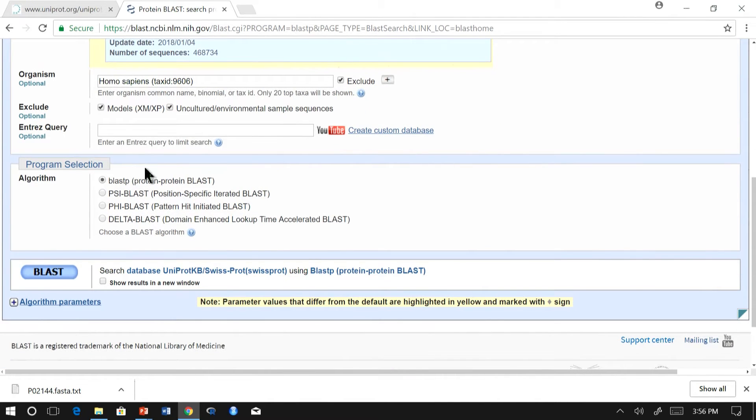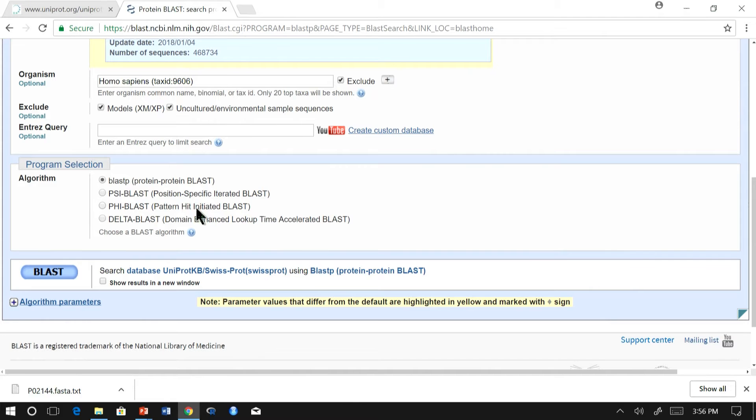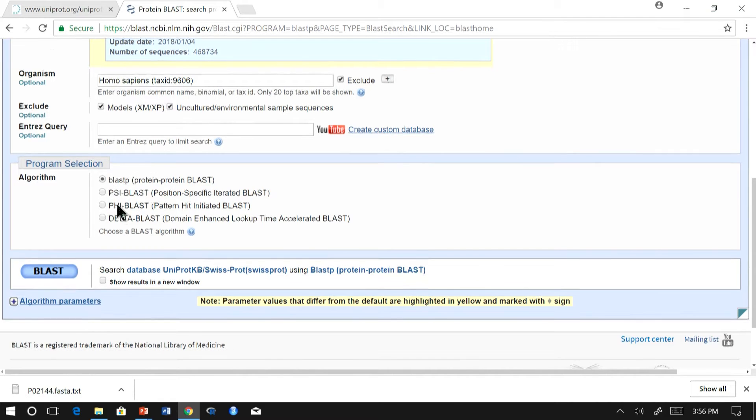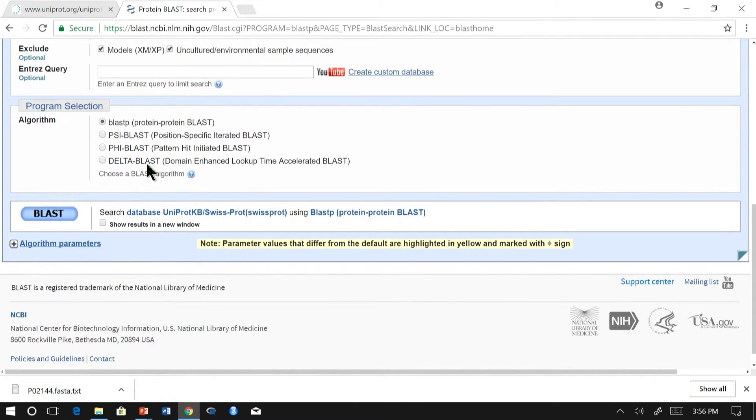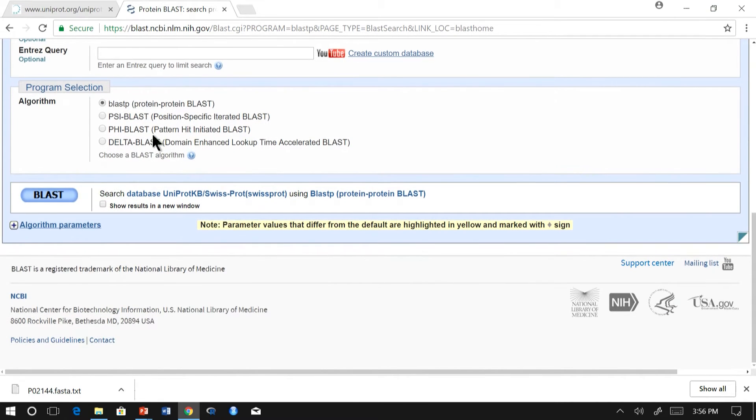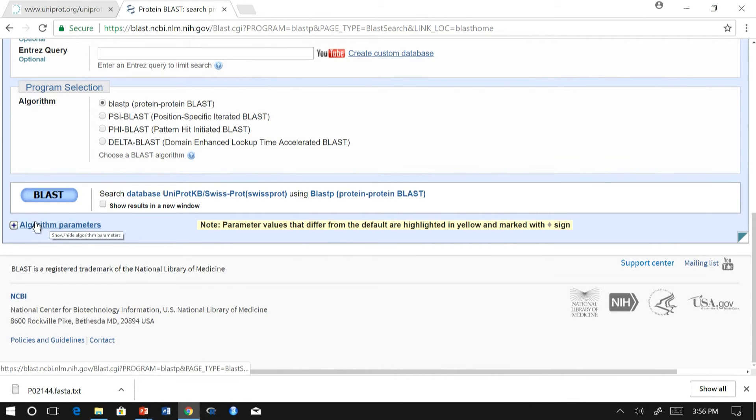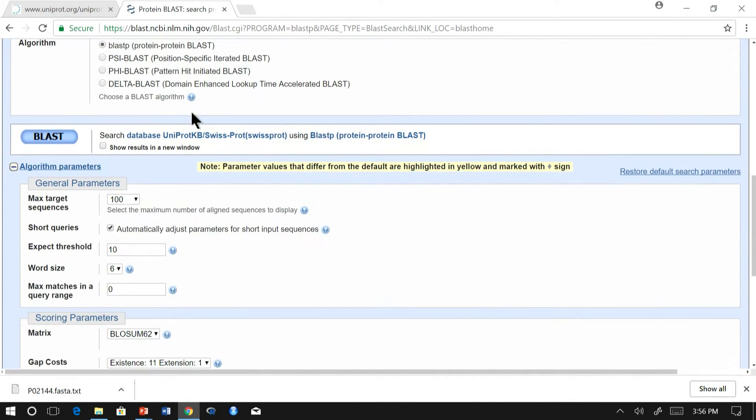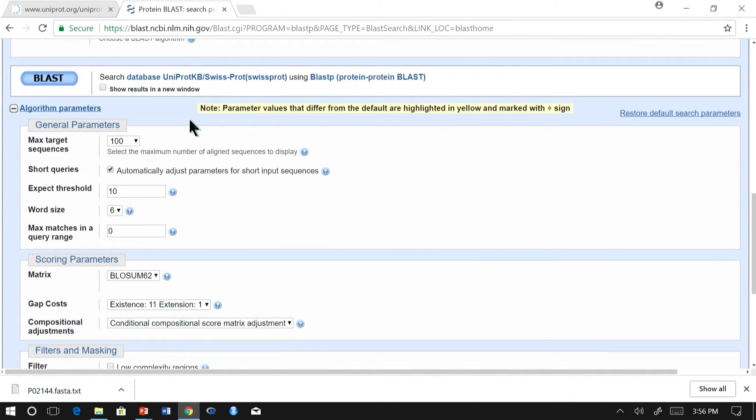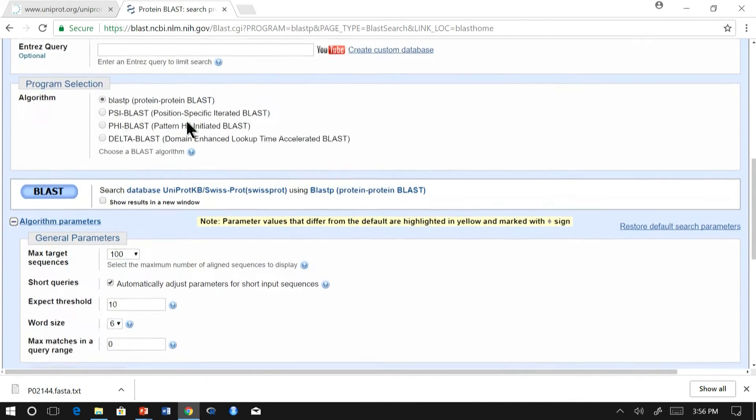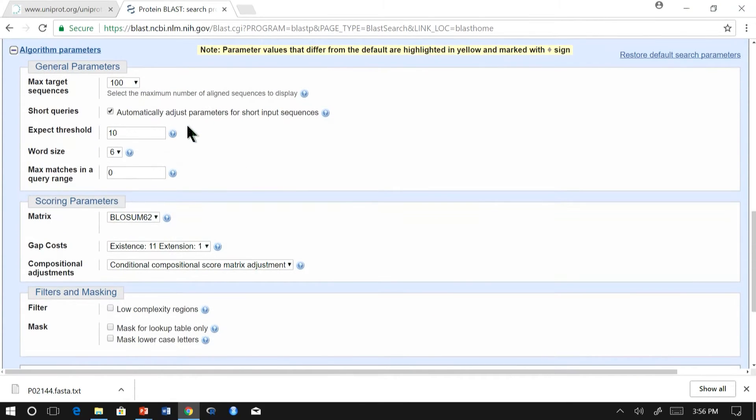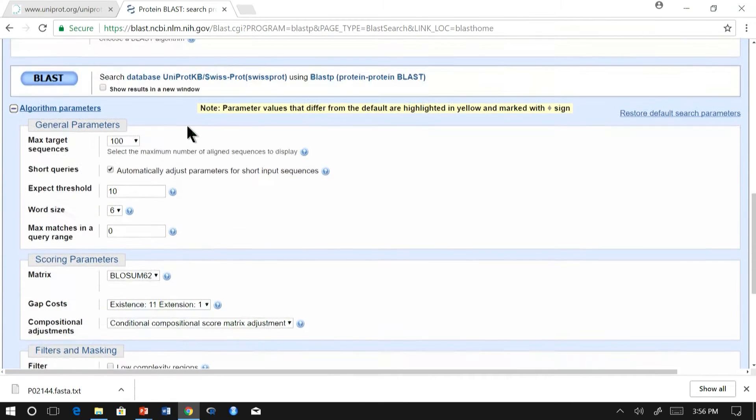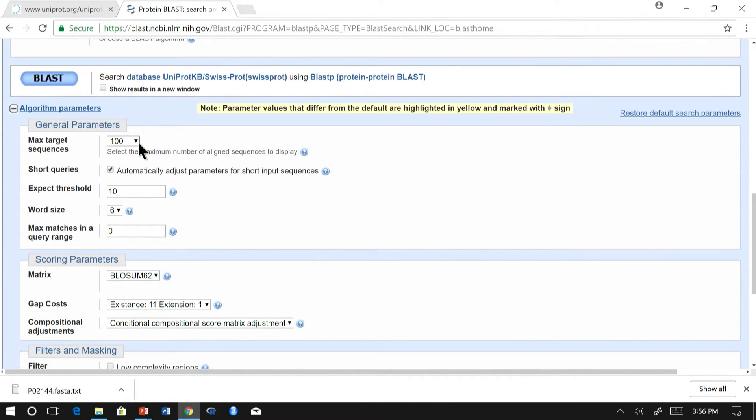The third section contains a program which you want to select: BLASTP, PSI-BLAST, PHI-BLAST or DELTA-BLAST. We will go with BLASTP. In case you need further details, you can go to the algorithm parameters to modify the search, the alignment algorithm.